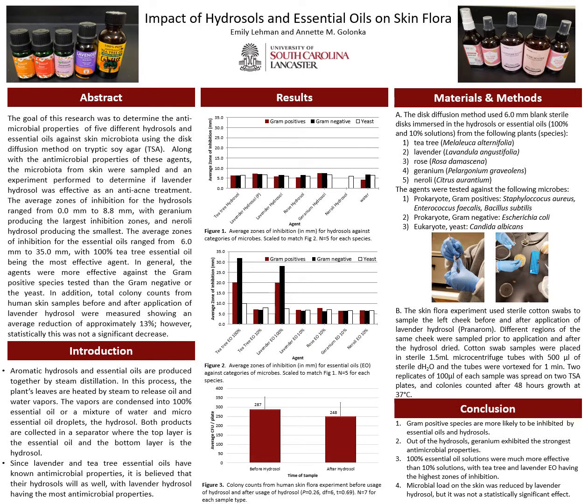Looking back at figure 1, I concluded that my hypothesis was not supported by this data. Geranium was actually the hydrosol that showed the most antimicrobial properties. Looking at figure 2, the tea tree oil and the lavender, both at 100%, definitely had the most antimicrobial properties, which we already knew.